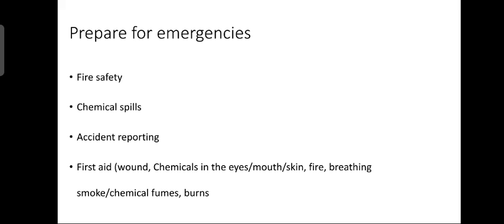It is important that flushing with water is continued for a prolonged time, that is for about 10 to 15 minutes. While flushing is continuing, arrange for medical attention.